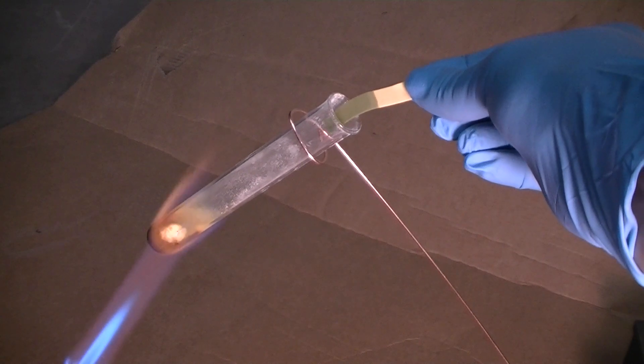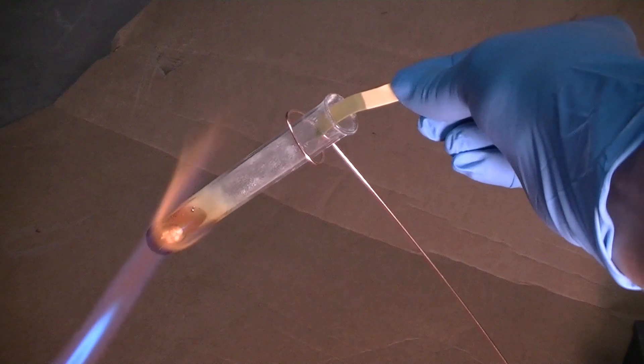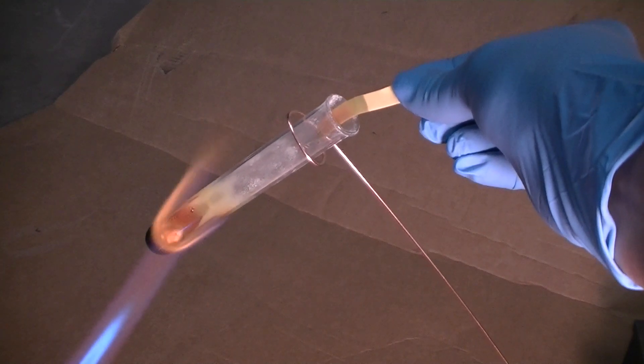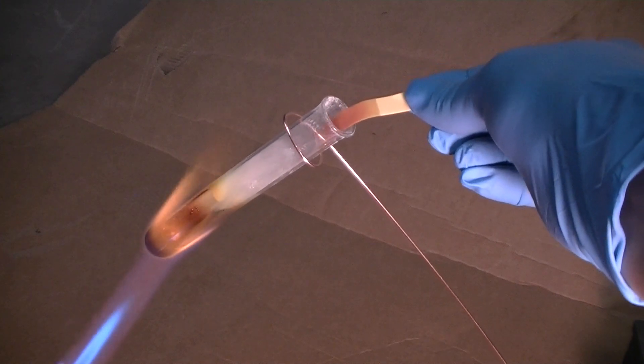At the neck of the test tube we are holding some moist litmus paper, moistened in water, hence the original green color. Green being a neutral pH of around 7, which is what you would expect for water.